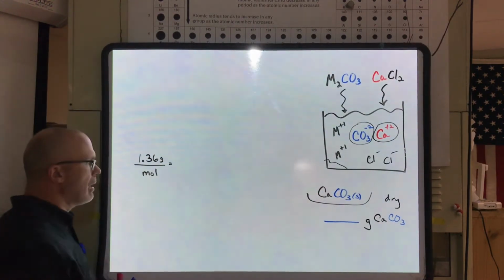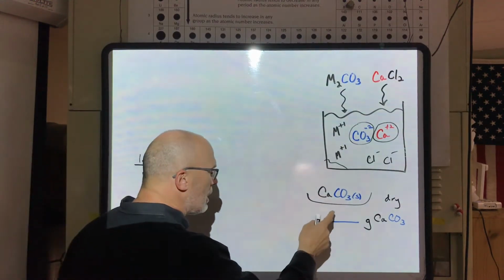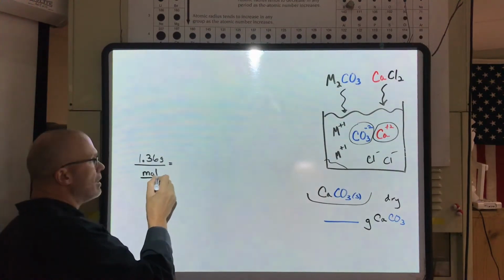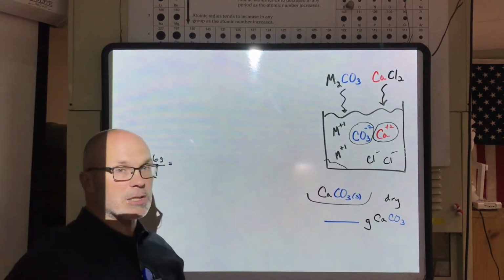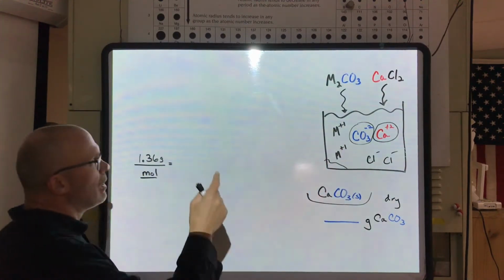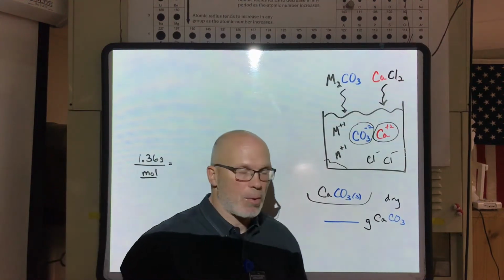All right, and what we're after to get our formula mass, grams per mole, is the moles of the sample. All we need to know is the moles of our sample, and we've got an experimental formula mass that we can start analyzing to see what, in fact, was that white salt. And that's, of course, the analysis part here.